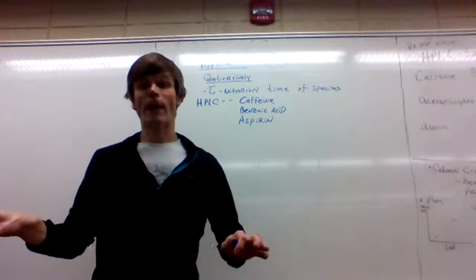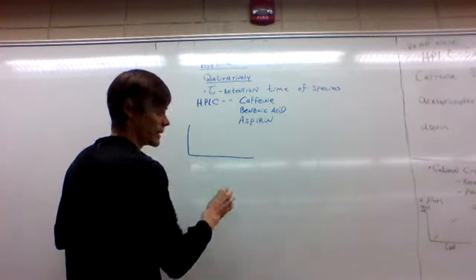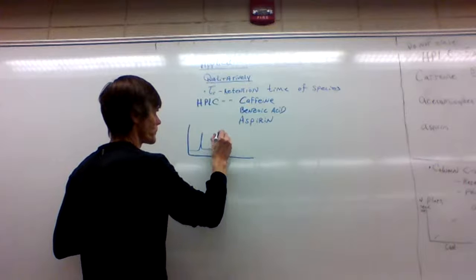And they run their analysis, their HPLC. I'm just going to make up some data here. And they get 3 peaks. There's three species in there.